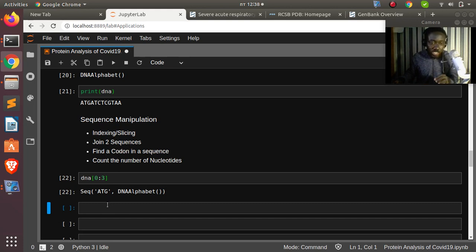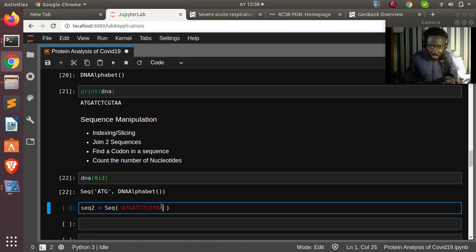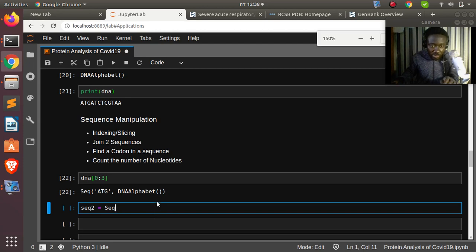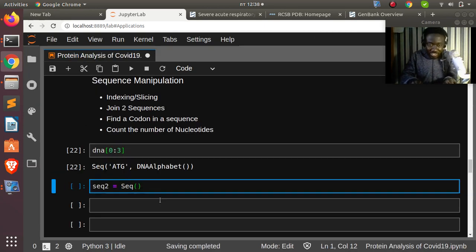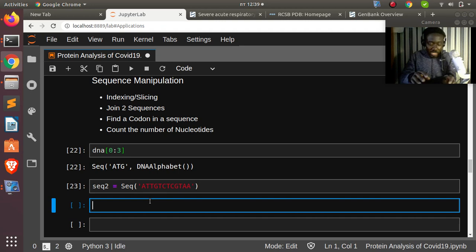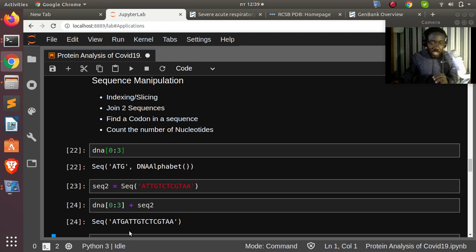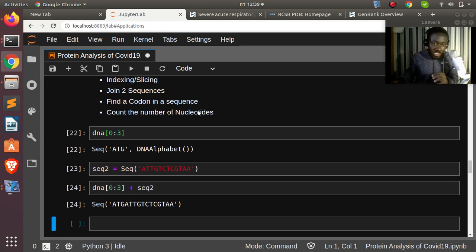You can also join two sequences together. Create a second sequence (seq2) with different nucleotides, then concatenate: dna[0:3] + seq2. This joins the first three nucleotides of dna with seq2 perfectly. You can also find a codon — a codon consists of three nucleotides.